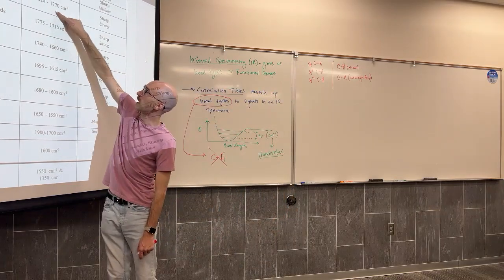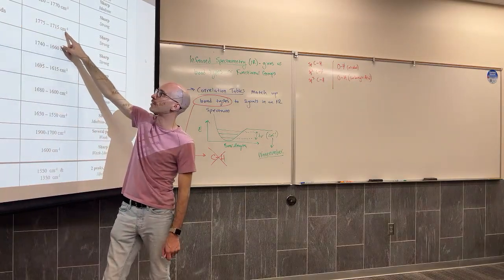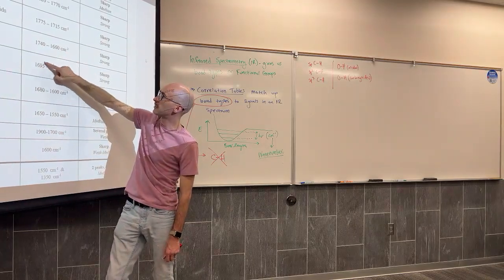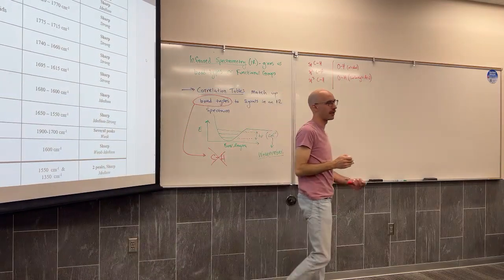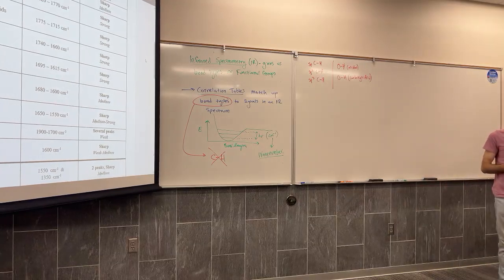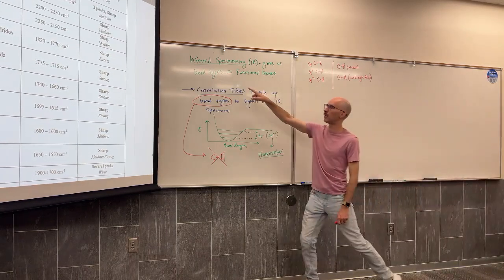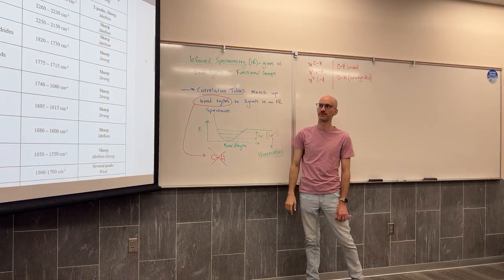You can see that this range has a small overlap with the next set, carboxylic acids and esters. And carboxylic acids and esters had an overlap with the next set of ketones and aldehydes. And ketones and aldehydes have a small overlap with the next type, the CO double bond of the amide. So we can try to be more specific as much as possible, but it's not always possible to get down to the exact functional group. So bond type, sometimes proportional to the functional group.